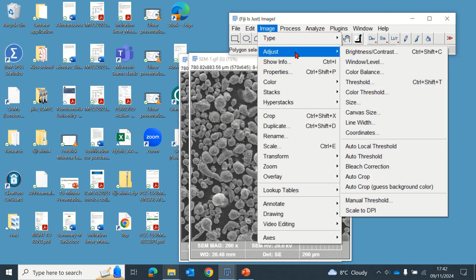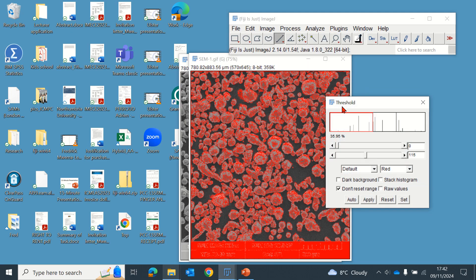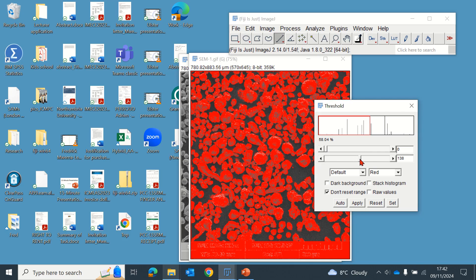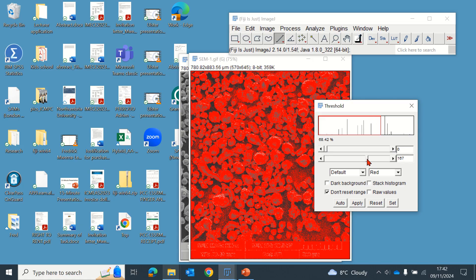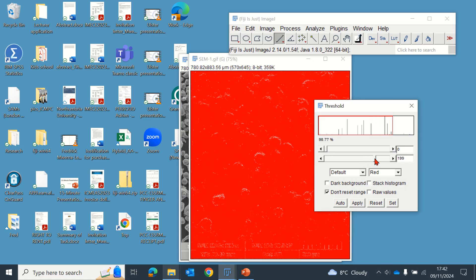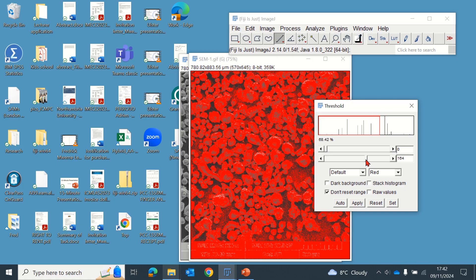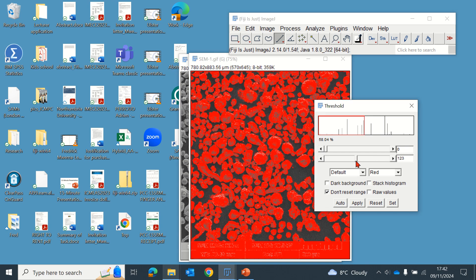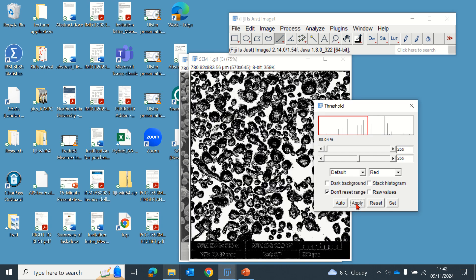Then you go to adjust threshold. Now here, whatever is colored red is what we want to measure. You can do that by playing around with this so we can make the particles as red as possible. Then we apply, and then we have our threshold image.